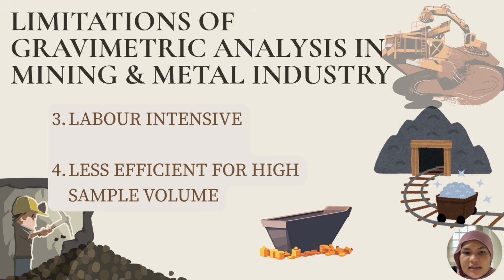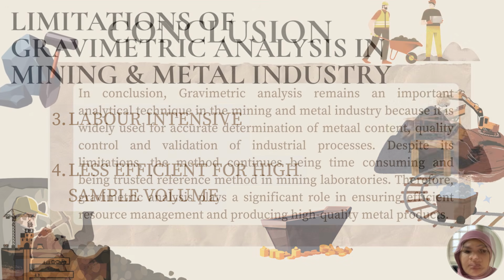Third, we have labor intensity. This technique requires skilled analysts to perform multiple manual procedures, increasing workload in the industrial laboratory. Fourth, we have lower efficiency for high sample volumes. Large mining companies often analyze many samples daily, making faster instrumental techniques more practical in some laboratories.